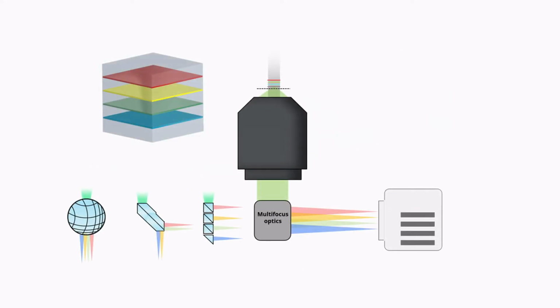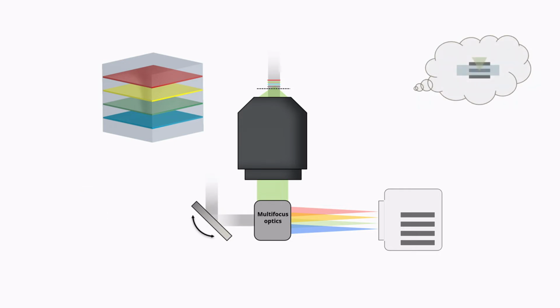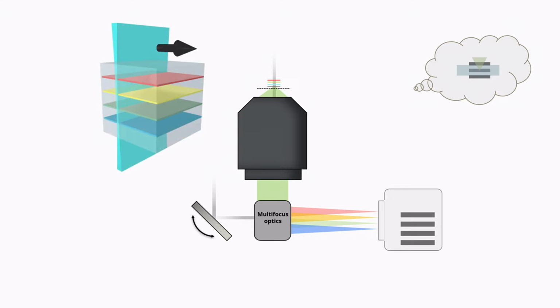And what we came up with is the following. So this is a regular multifocus microscope. And now we just put Galvo mirrors there and change our illumination to be a light sheet. It just comes straight out to the objective. It's not orthogonal. And we just scan that. And let's see what happens.